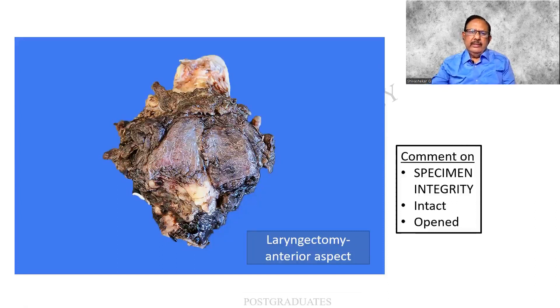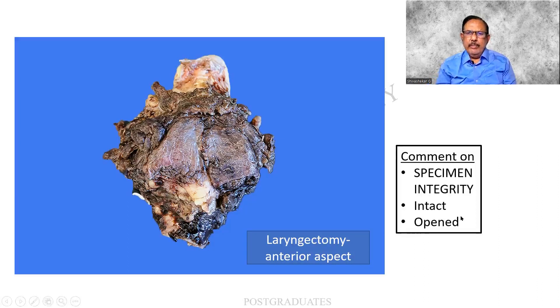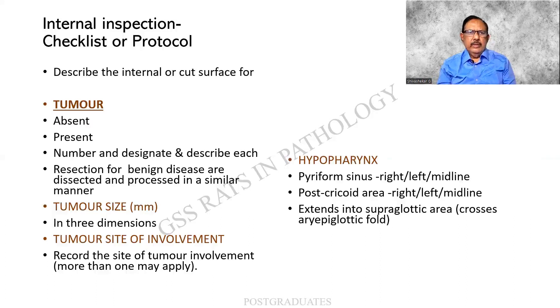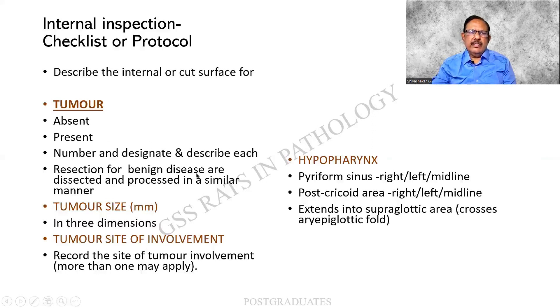A beautiful picture — this is the anterior aspect, where I am finding a larynx completely covered by muscle, fascia, and so on. It is almost complete. Whenever we do a grossing, we are supposed to comment on the integrity of the specimen, whether it is intact or open. This is the laryngectomy anterior aspect. A checklist is always needed — it can be similar to your CAP protocol. Tumor: whether present or not, number, size, etc.